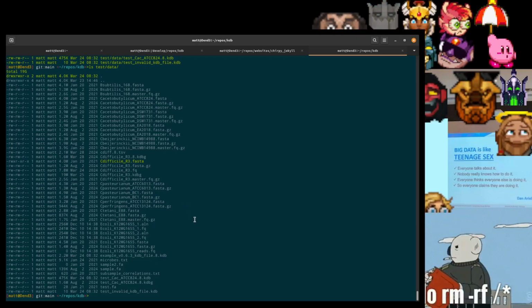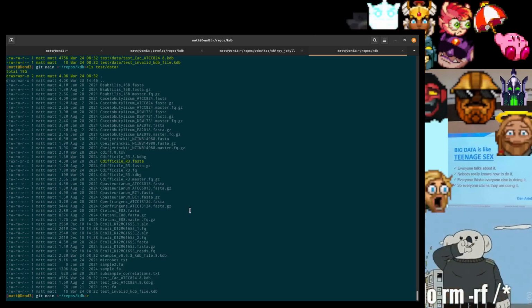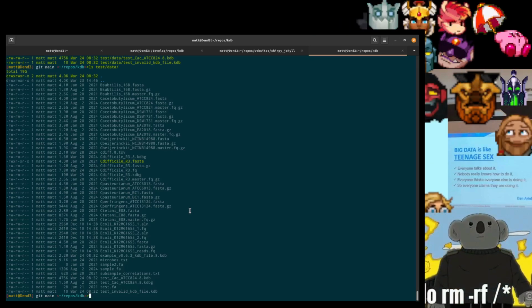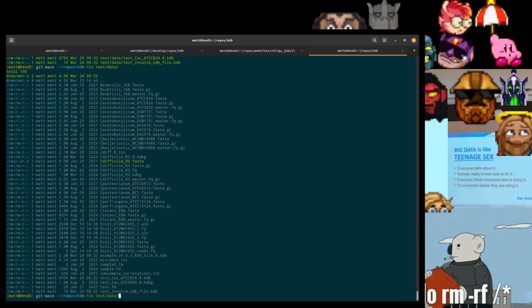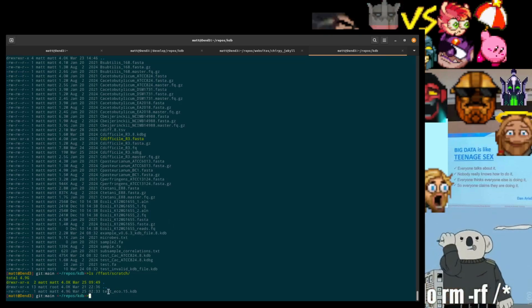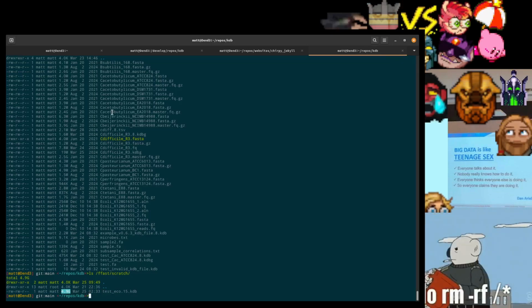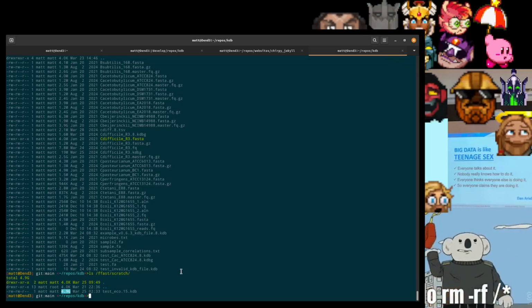In the previous video, I mentioned that the 8-mer profiles are ridiculously small, just a few dozen KB. 12-mer profiles, including the compression, can get up to several megs. However, this 15-mer profile, when compressed, because there's a billion, gets up to 5G. So that's a considerable amount of data to load into memory on a laptop.